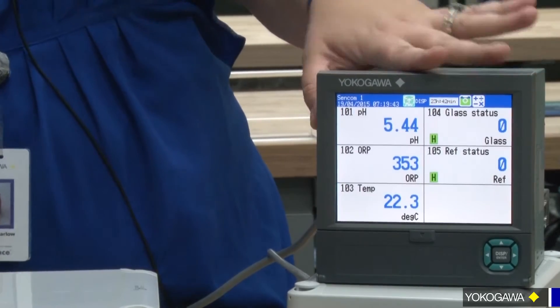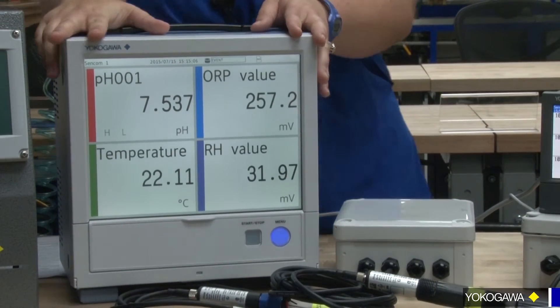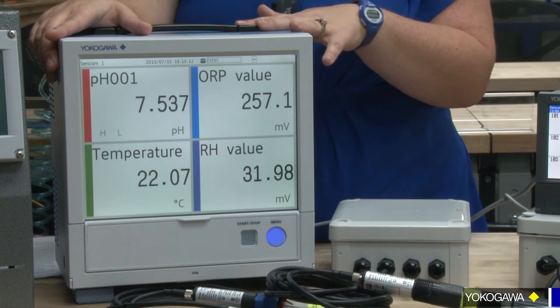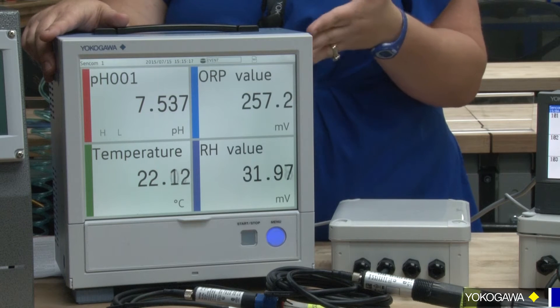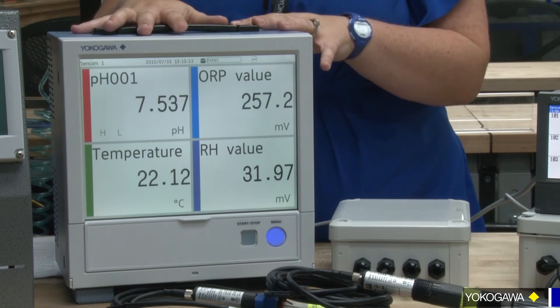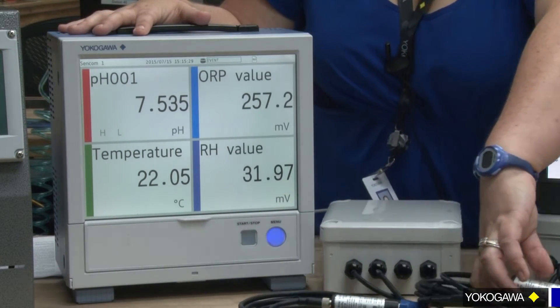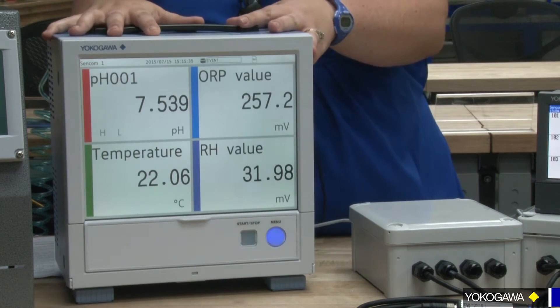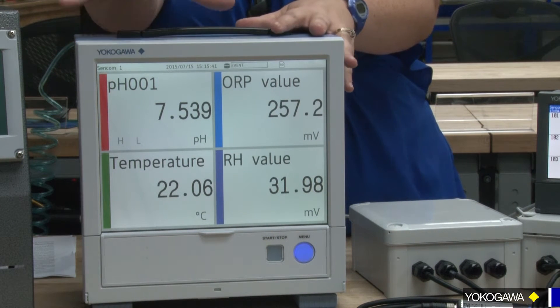Now let's go over to our GX. This is our GX20 — it's a bigger one. They do have a GX10, which is more the same size as the FX that we just looked at. But here, based on what you choose when you build your model code, or the expansion packs that you have, you have the capability of doing over ten sensors into one GX. You still have your interface box that you're familiar with, but you have the capability of connecting ten, sixteen, twenty sensors into one analyzer, allowing you to take multiple points throughout the whole plant into one analyzer.